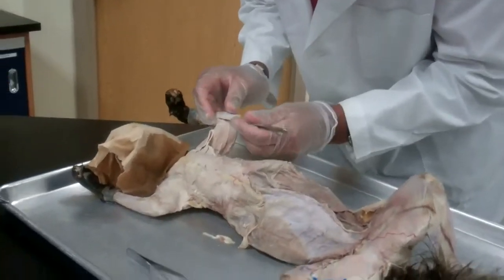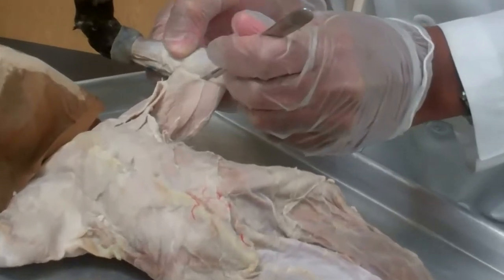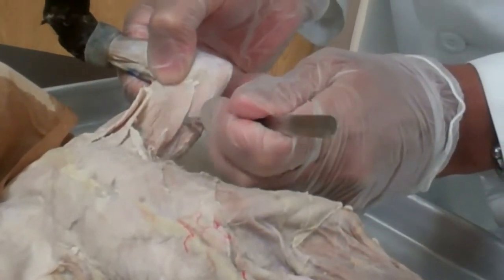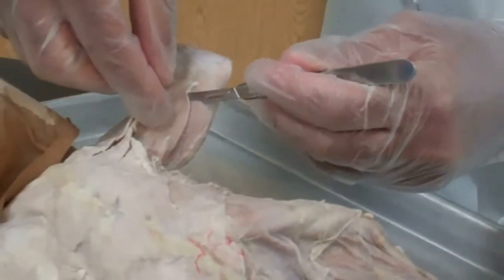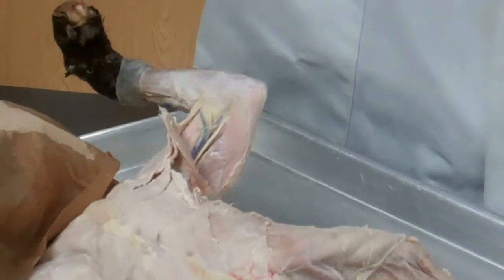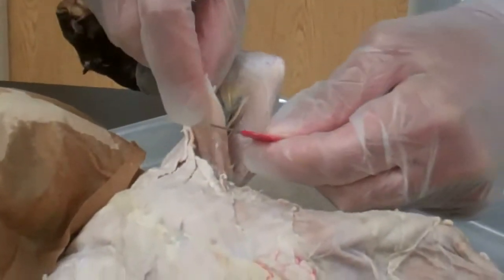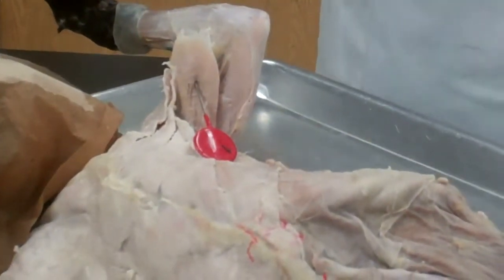So the pectoralis is located right here. Right along this line is where you make the incision, where the fascia is, and then you will be able to peel back the pectoralis. So number one, this muscle here, number one pinned, is the pectoralis.